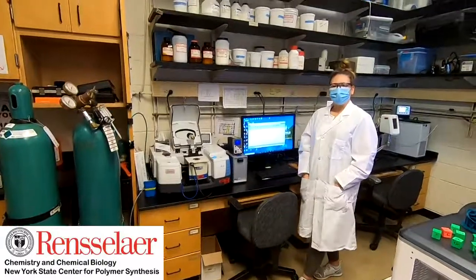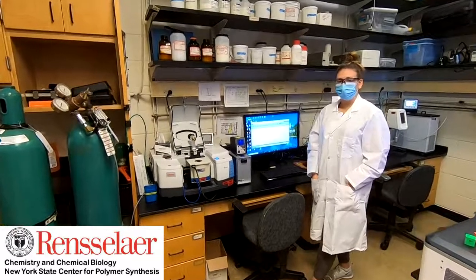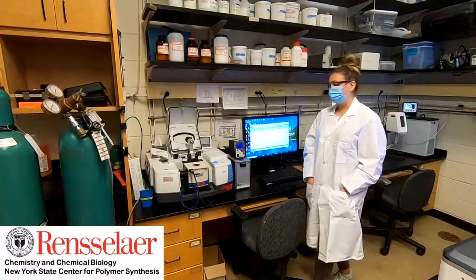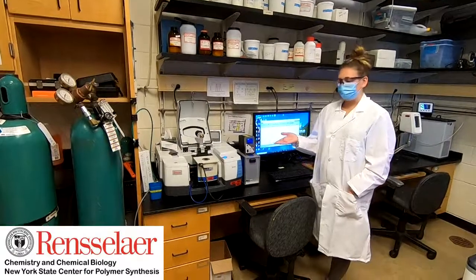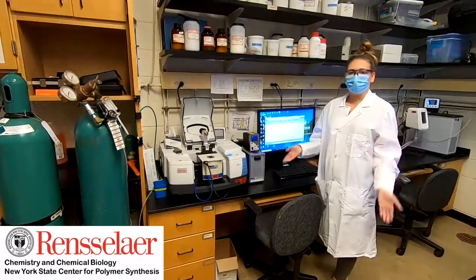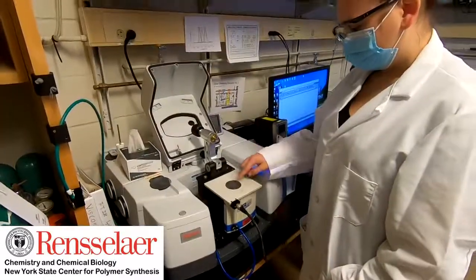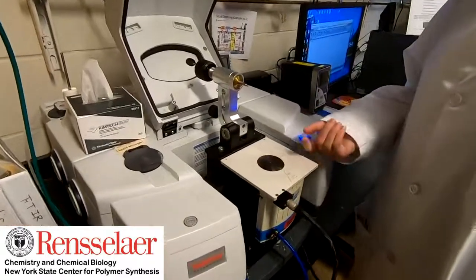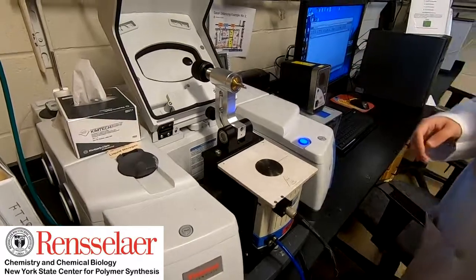Hi, I'm Lauren Zarzeski. I'm a second year PhD student at Rensselaer Polytechnic Institute, and today we're going to talk to you about FTIR, or Fourier Transform Infrared. This is our spectrometer right here, and this instrument allows you to examine the fingerprint spectrum of any compound or any substance you want. Essentially, you put your sample on the center of this little platform, and the IR beam comes up from underneath and scans into your sample to produce your spectrum on the computer.